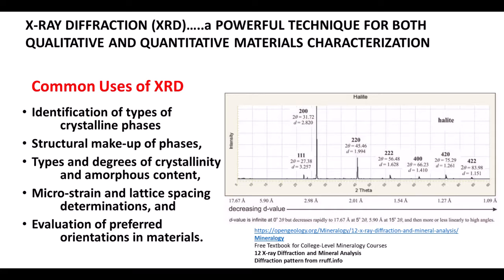From an XRD pattern, we are able to identify the crystal structure of the material, but we are also able to extract the crystal lattice spacings of the material with sufficient accuracy that these lattice plane spacings, or D spacings, can be compared to the known values from previously measured material XRD patterns. The values of the D spacings combined with the crystal structure information can significantly reduce the possible materials that fit the D spacings of your unknown material.